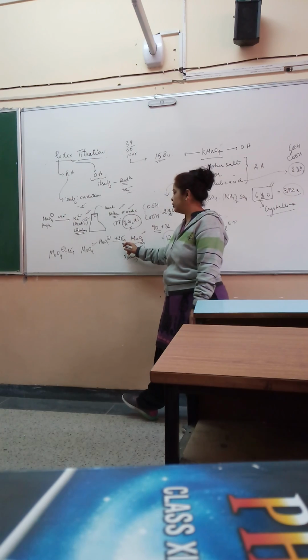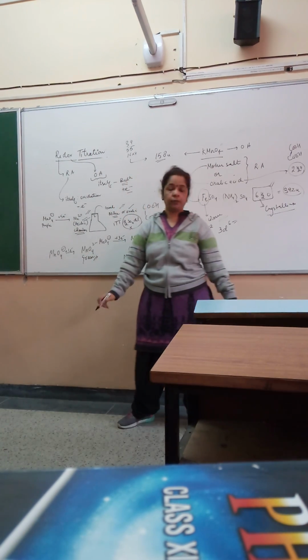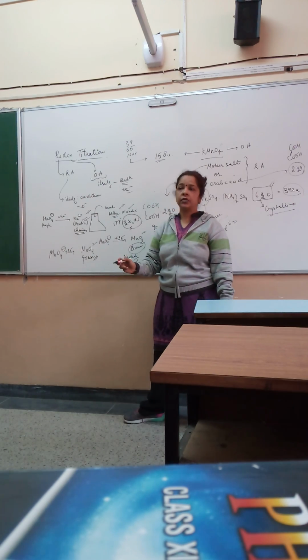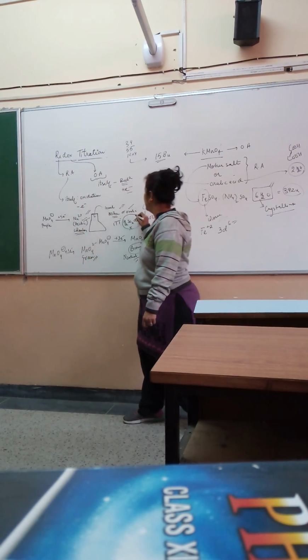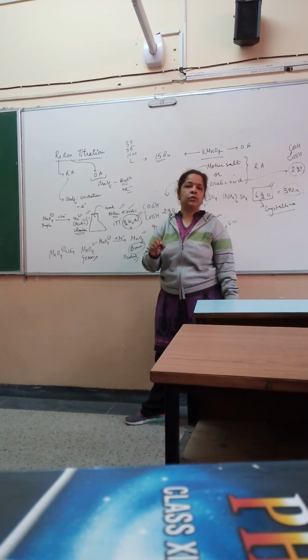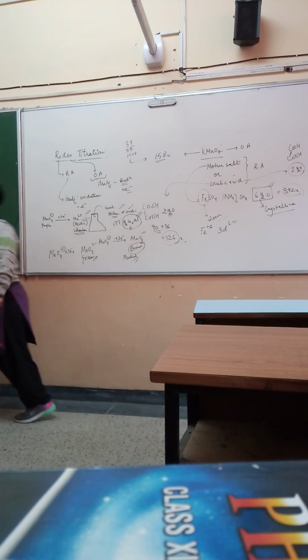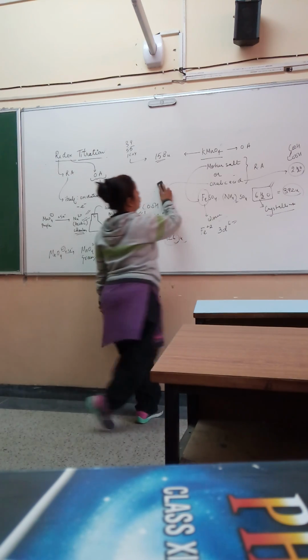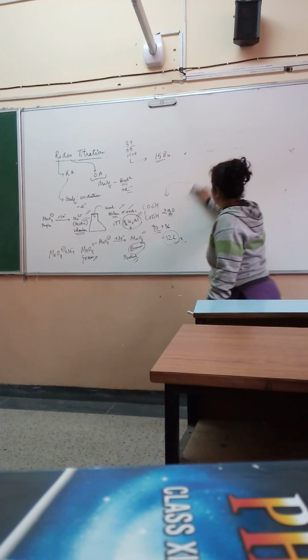If it changes to brown or it changes to green, as in this case, you will not be in a position to see the end point. So we do not use any of these situations. We deliberately add the test tube full of dilute sulfuric acid. Acidic medium cannot be maintained with either nitric acid or with HCl. There is a specific reason for it.